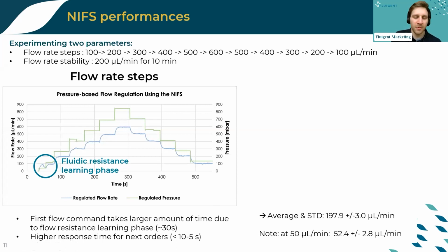So I will mention some typical applications. For instance, if you have a stable flow rate injection, it's pretty convenient. The system is a right fit with your system. But if you have flow rate changes every 1 second, it may not be the perfect fit.